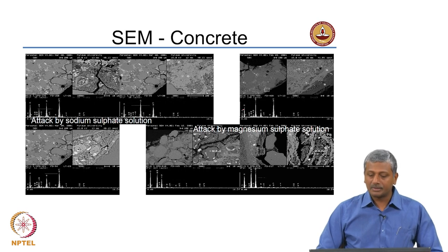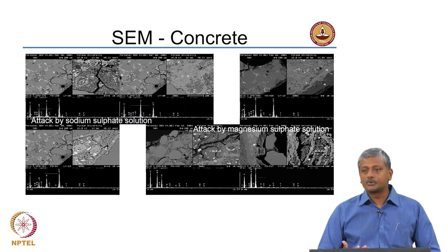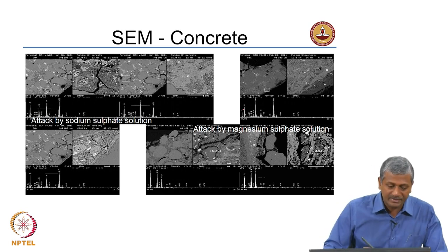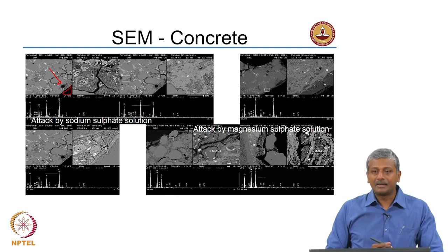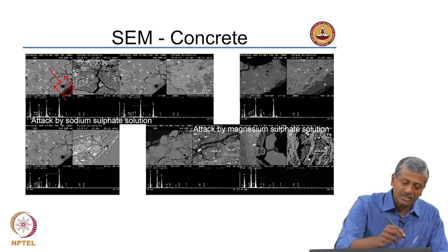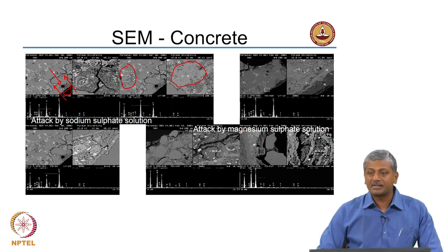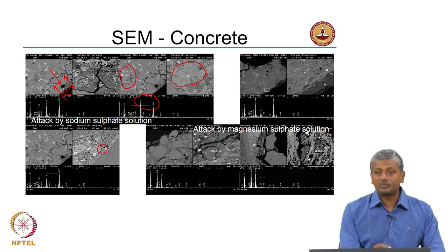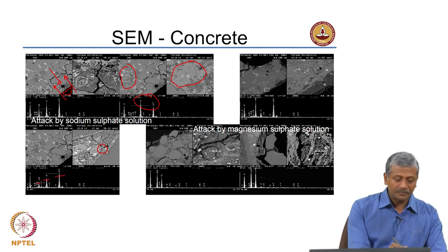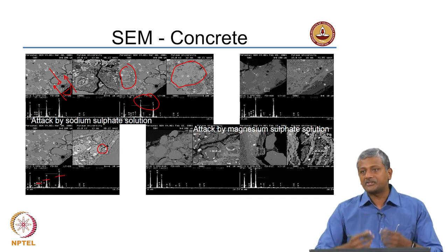Here are other examples of concrete specimens which have been attacked by sulphate solutions. When external sulphates enter the concrete, they interact with the cementitious hydration phases to produce attack products like gypsum and ettringite. Here is a cement mortar in contact with a sodium sulphate solution. The sulphate penetrates into the sample and you can see large deposits — marked as G for gypsum, calcium sulphate. In other inner zones, a spot marked E is ettringite, containing calcium, sulphur, and aluminium — one of the common phases in sulphate attack causing expansion and cracking.